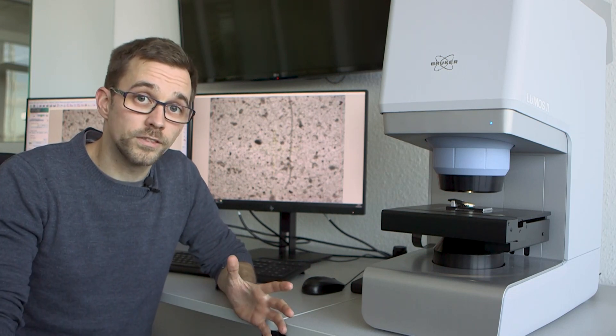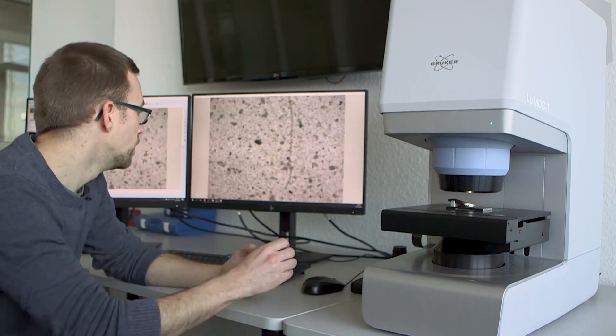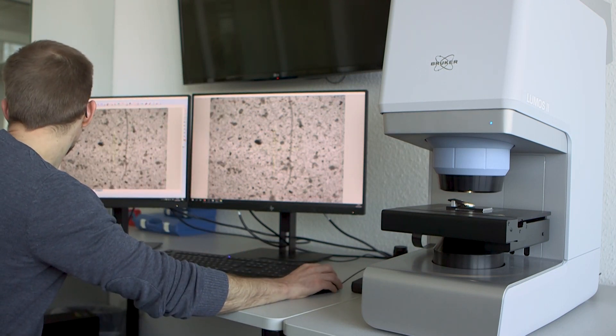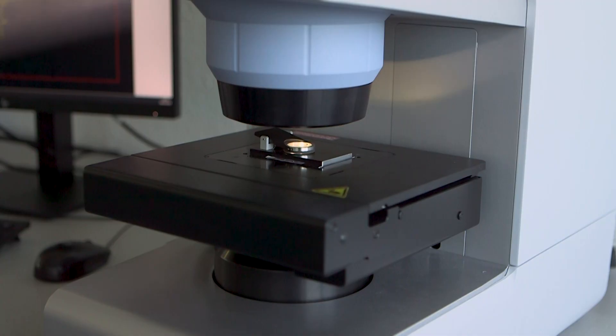Now in the analysis of our sample, the first step would be to take an overview image of your sample. If you're not interested in the overview image, you can just skip the step and go directly to the analysis.